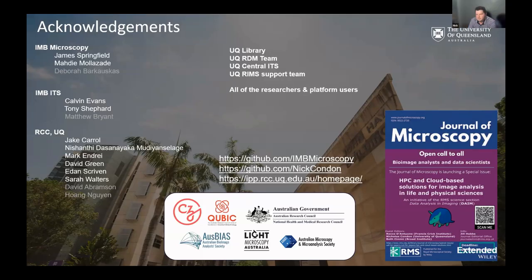So the image processing portal was geared to an audience that wasn't developing stuff, because if you're at the level of writing your own full Python Jupyter notebooks, you can probably use Open OnDemand or your own things and can navigate Slurm on your own. This was more for a student who's got multiple terabytes spread over thousands of time points of volumes. They just want to MIP it, or do a processing step, or deconvolve it and then run scripts on that. It was built with that in mind. So they're two separate circles in our use case.